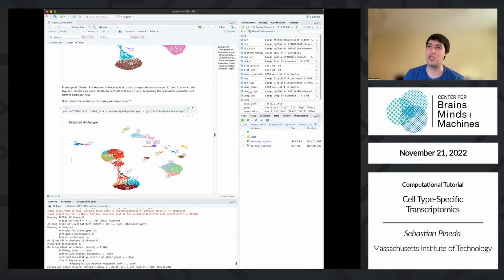So this is a really good way of identifying groupings of cells that are, for example, the result of some technical artifact. Maybe they're under-sequenced, or very contaminated. It also gives you things that Leiden won't tell you, like you might have a grouping of cells characterized by an increase of stress markers.